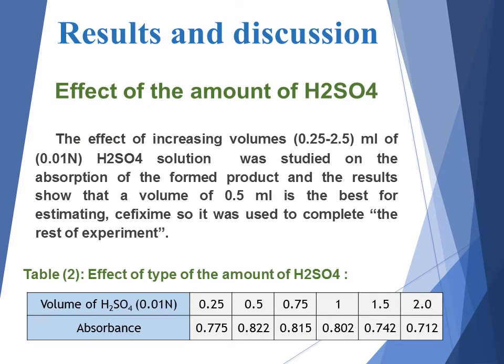Effect of the amount of H2SO4. The effect of increasing volumes from 0.25 to 2.5 ml of 0.01 normal H2SO4 solution was studied on the absorption of the formed product, and the results show that a volume of 0.5 ml is the best for estimating cefixime, so it was used to complete the rest of the experiment. Table 2, effect of the amount of H2SO4.